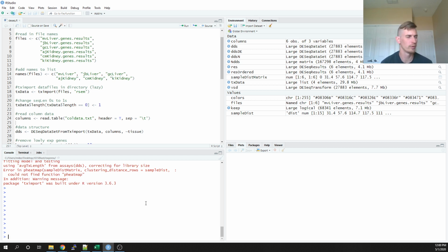All right. So I think this is the last video lecture that we're doing for this course, doing some expression analysis. Reminder that we have files that are thousands of lines long that we really can't look at one line at a time to get an idea of what's happening in this data. So it almost becomes a requirement to plot some of this data out.